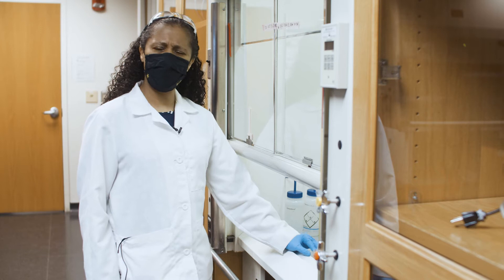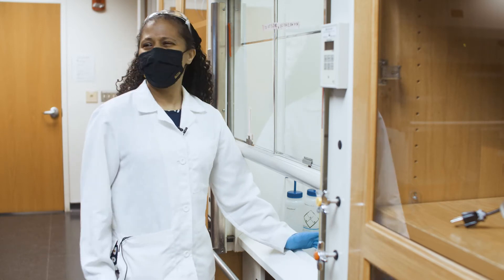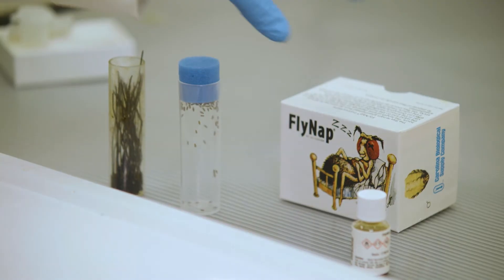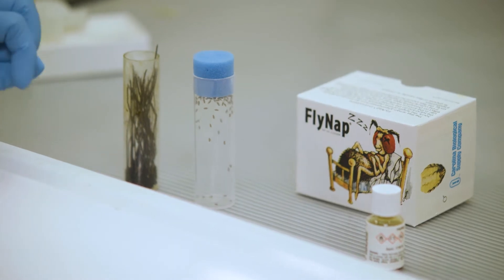In my lab we typically use CO2 gas in order to knock them out. However, in large teaching labs you rarely have the setup to use CO2, so instead we're going to use a chemical called FlyNap. You can get it for maybe 10 or 11 dollars online.